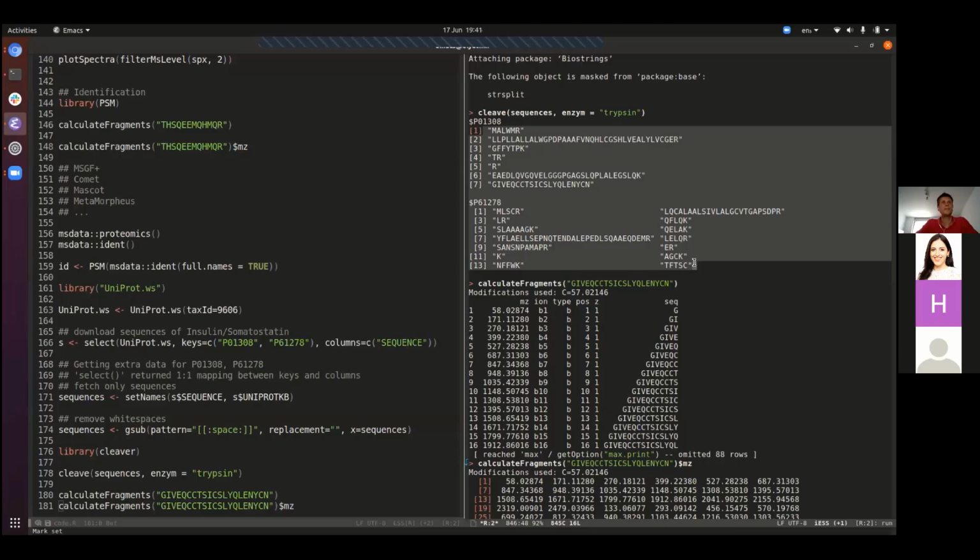And then at the end of the analysis, we have the m/z ratios with the different intensities. Yes. Then, I want to clarify one thing: what enters the mass spectrometer are peptides, not proteins. We cut the proteins into peptides in the lab before starting the acquisition, but otherwise that is correct. Oh, right, so there is an enzymatic pre-digestion step. Okay, sorry, that's what I misunderstood.